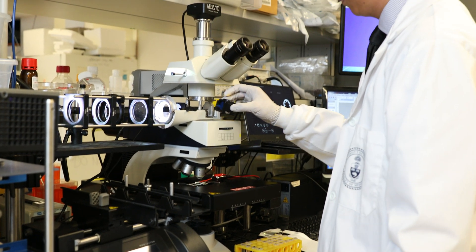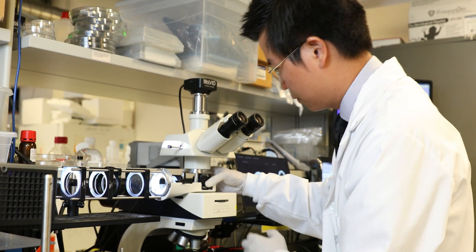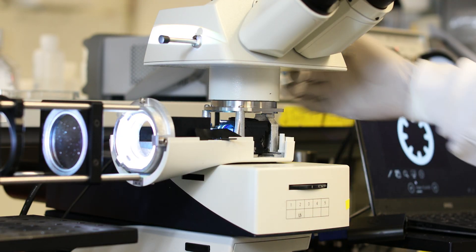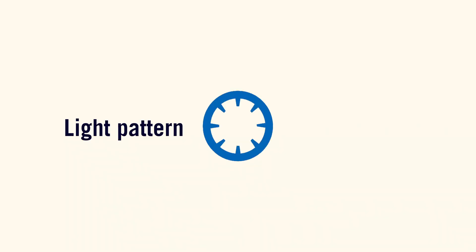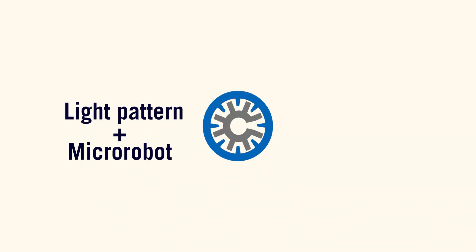We've developed micro robots that are controlled by a special type of electrical force called dielectrophoresis, controlled by the application of light. We project patterns of light into the microscope that generates the dielectrophoretic force which manipulates the robots. The robots can then be made to scoop up individual cells or other payloads.